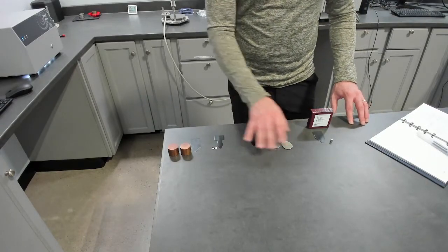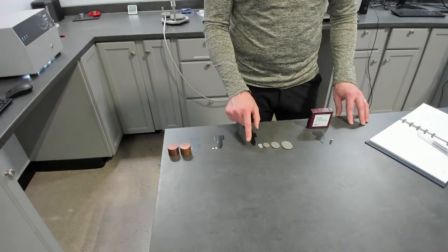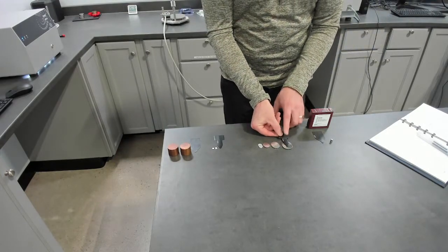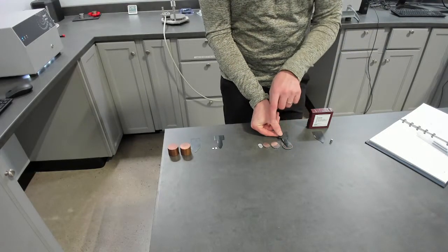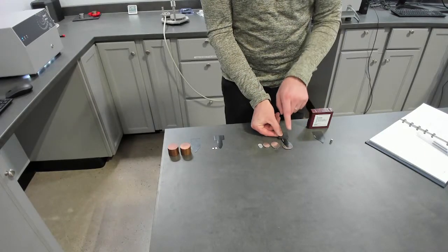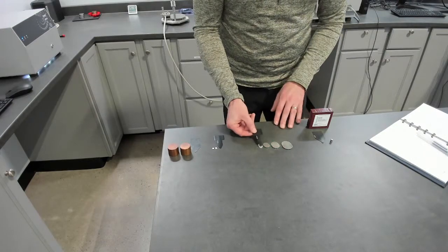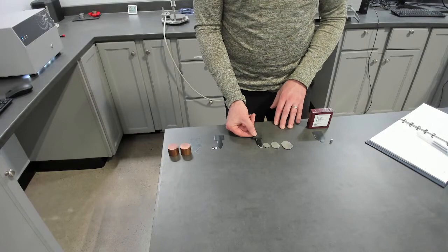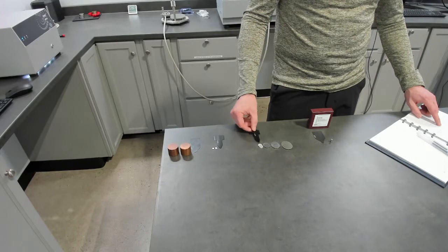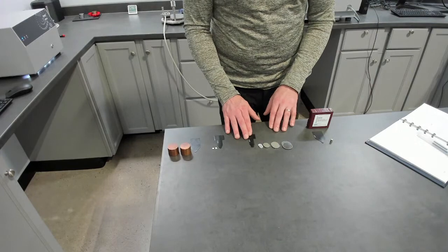So what we did to really emphasize the importance of test time is we measured each of these with the slab module, and in the slab module, the penetration depth is from the edge of the sensor to the edge of the sample in that in-plane direction. So with the slab module, we're isolating the thickness and looking at the penetration depth from the edge of the sensor to the edge of the sample. On the smallest sample, that's a very small penetration depth. I could calculate it when I get back to the computer, but it's very small, and the test time is very small.